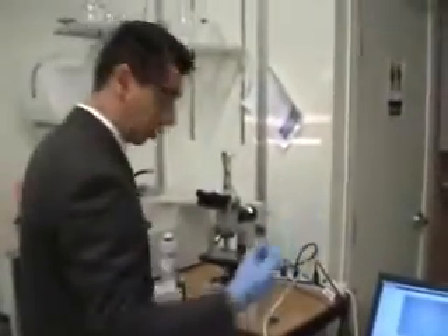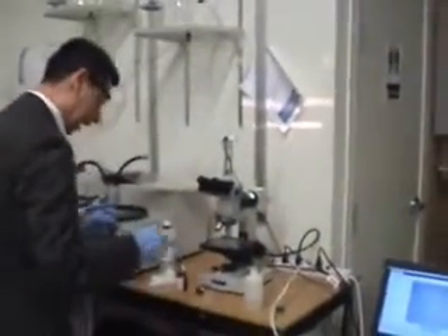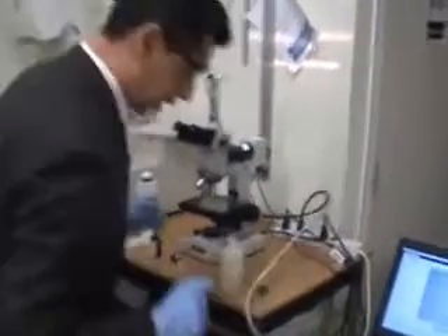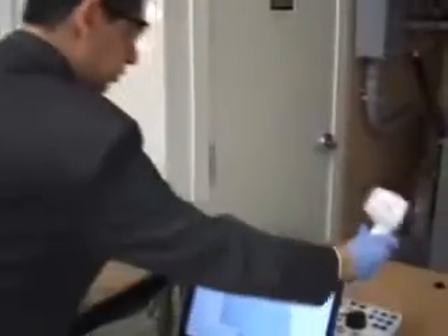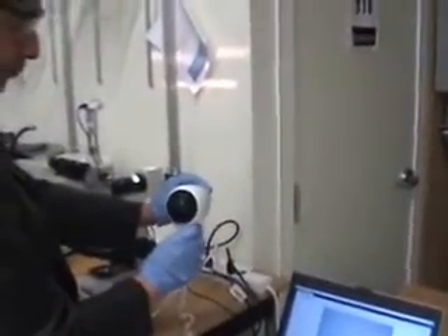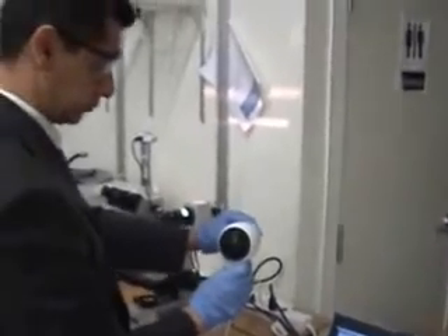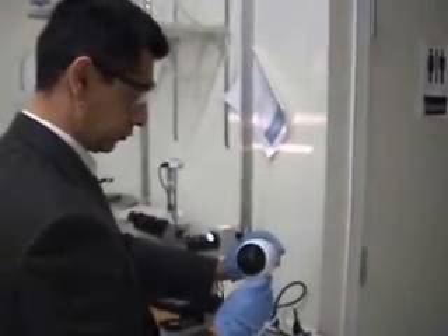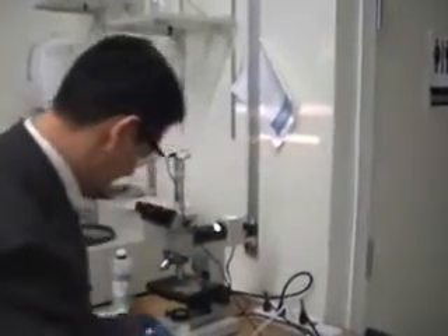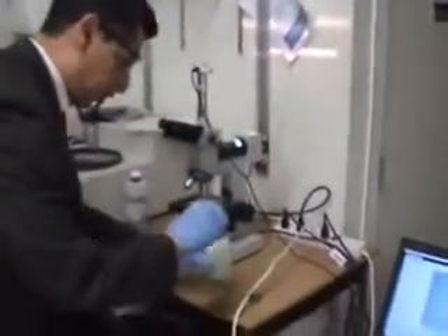I'll pick another specimen here — it's perfectly polished. I clean the surface with alcohol and use this hair dryer to dry it. And now I have this nital.